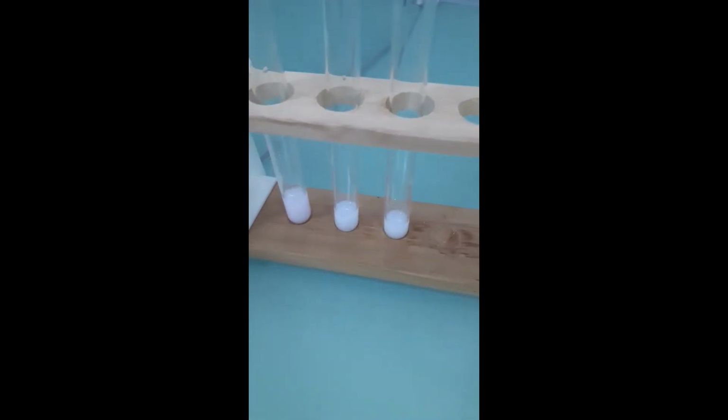Good. So those are the 3 test tubes from the left: carbonate, sulfite, sulfate. Now we're going to test the solubility of these 3 precipitates with HCl. So that's what's going to be added now. Carbonate.